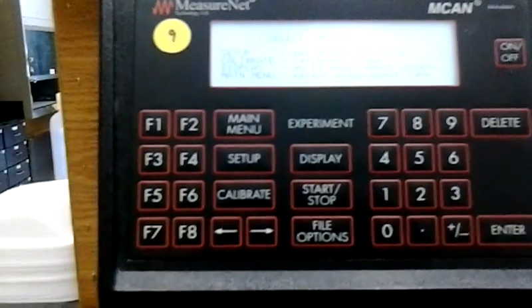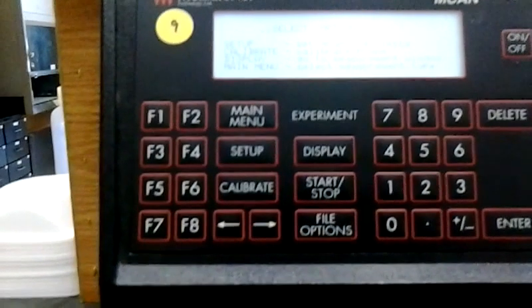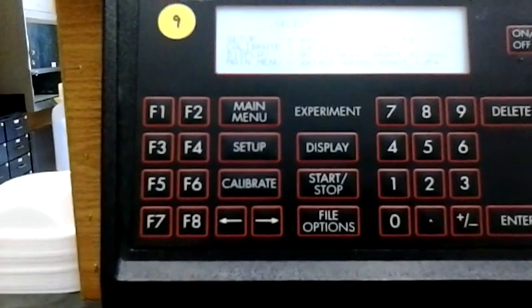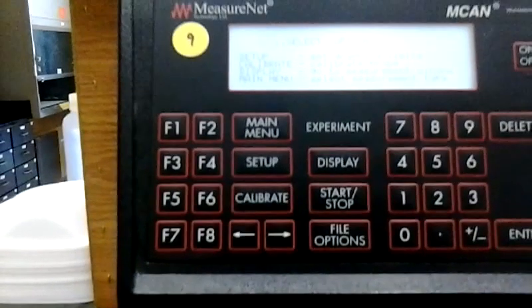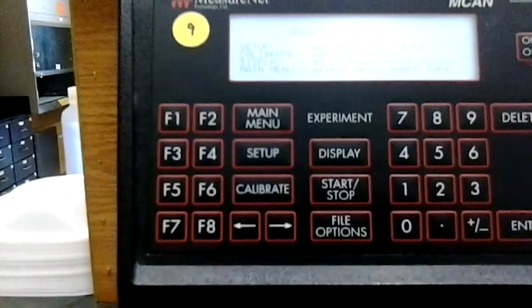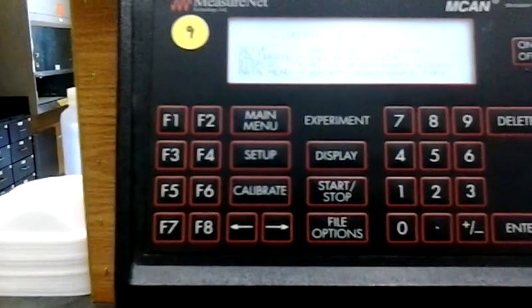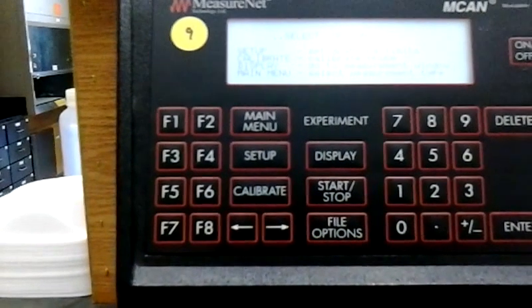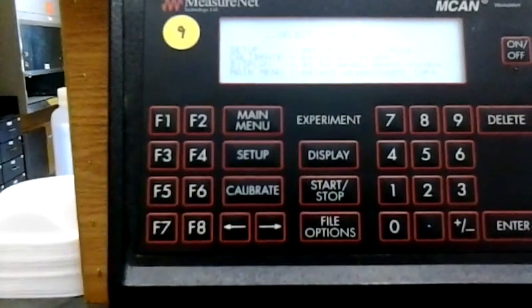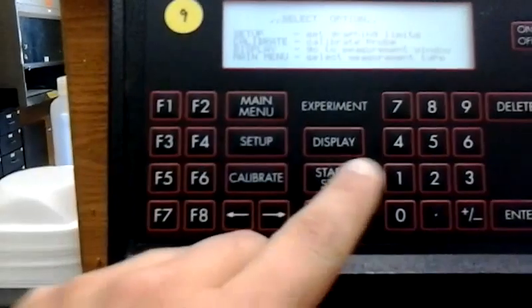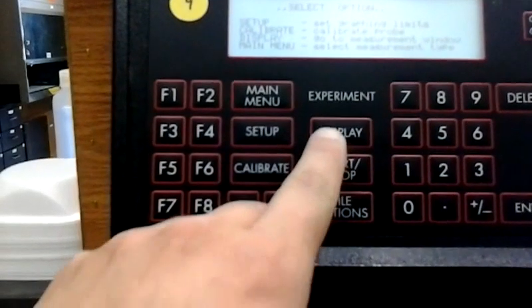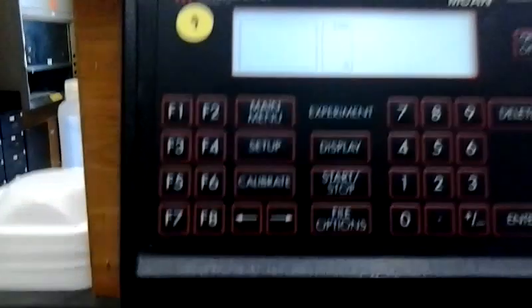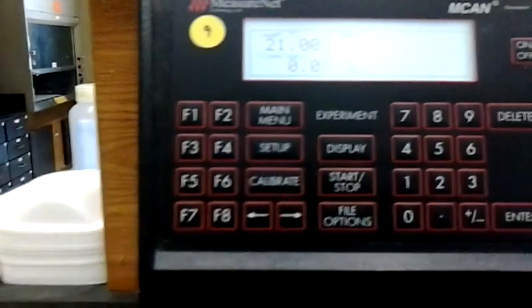Once you hit enter, it takes you back to the main menu for the temperature setting where you see setup, calibrate, display, and main menu. So now what we want to do is hit the display button right here to begin measuring our temperature.